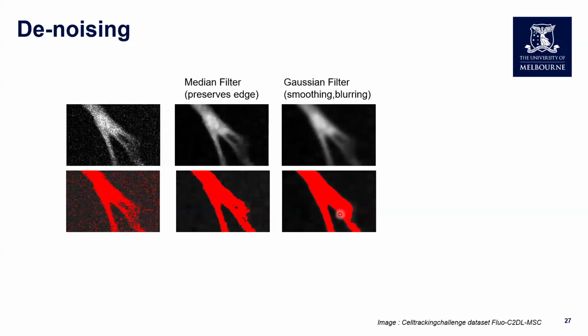You can see that both filters make object detection better, but in slightly different ways. Most image analysis software will have both filters, and there are so many more types of filters. If you want to know more about different types of filters and how they work, this image processing handbook will be a very useful reference.